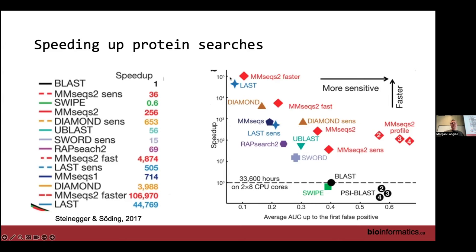So like with Microbiome Helper, I was not super satisfied. And so now we just take every read and try to map it, one through Kraken to a taxa, and then two to MMseqs to a functional database, to improve this stratification process.